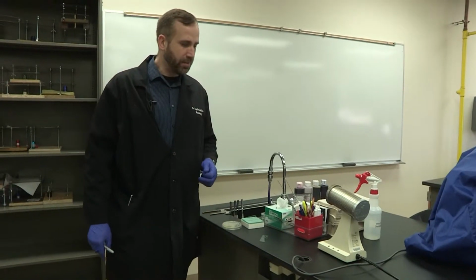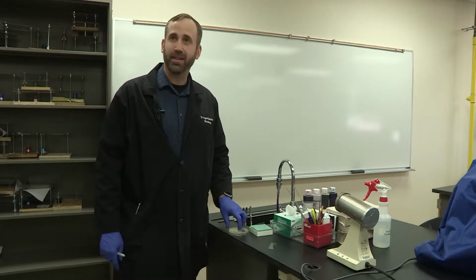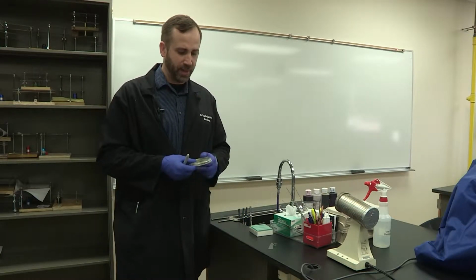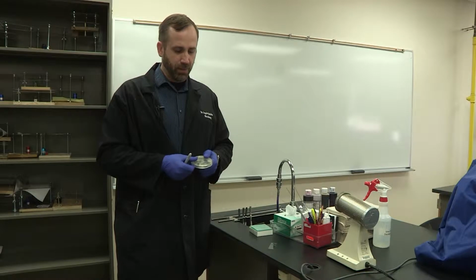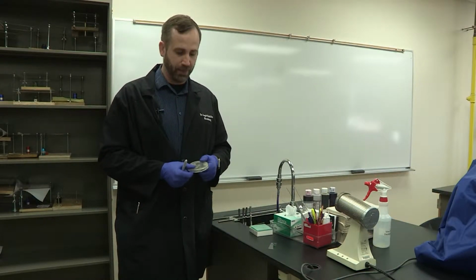So now we're going to demonstrate one of the most important stains in all of microbiology with the isolate that you had that was producing antibiotics. And so we're going to determine whether or not this isolate is indeed gram-positive or gram-negative.